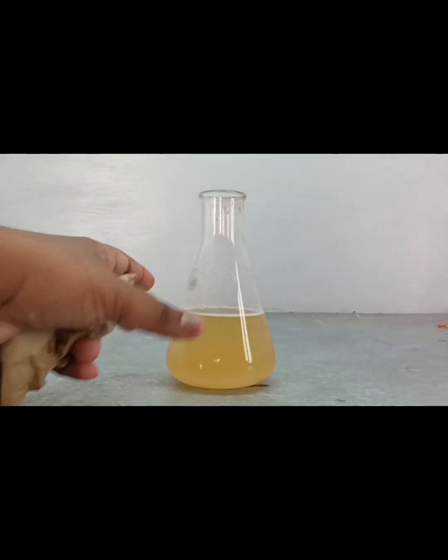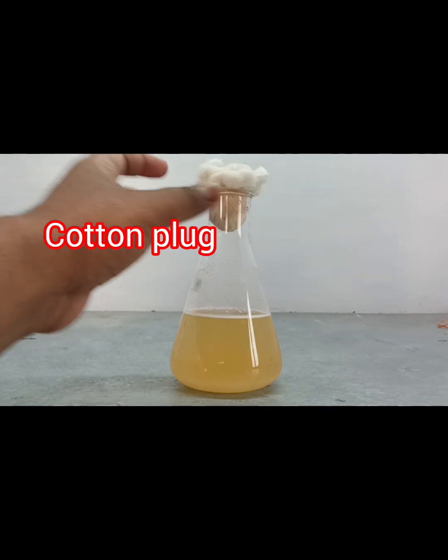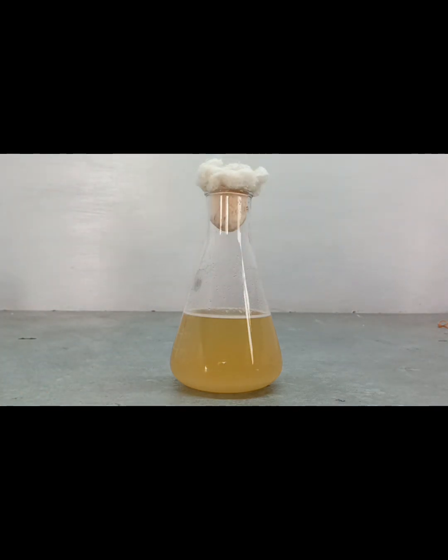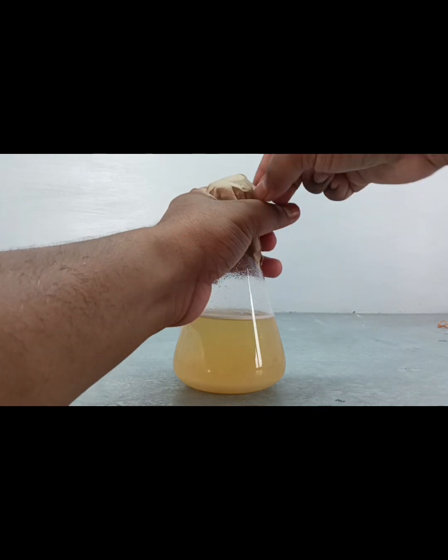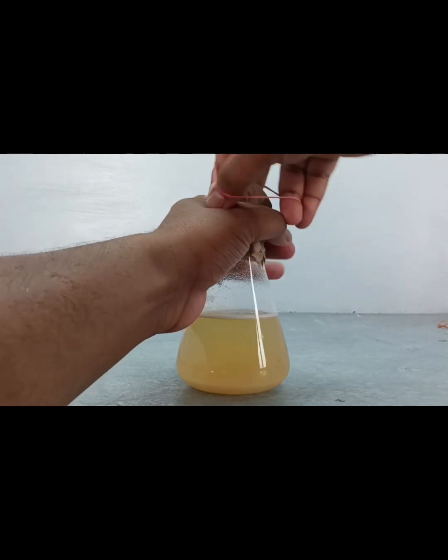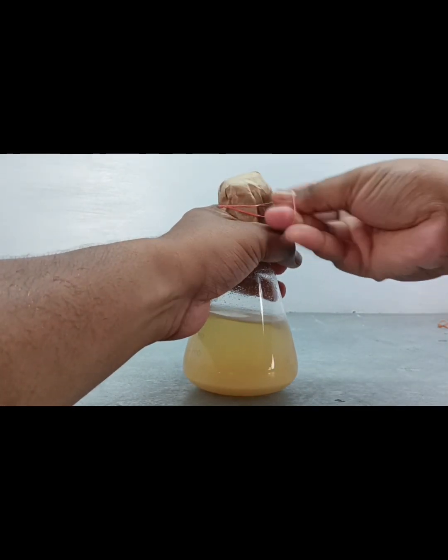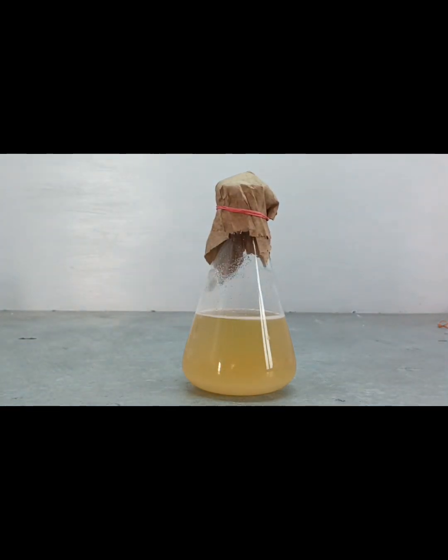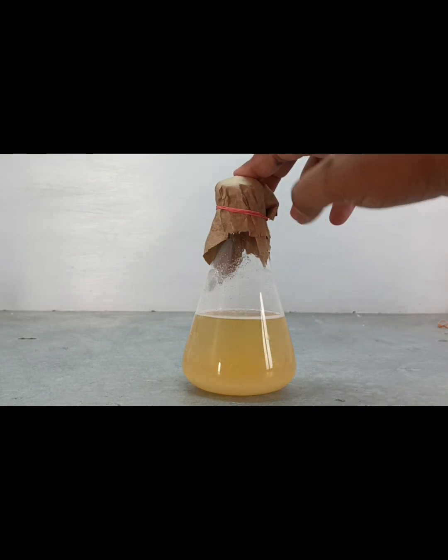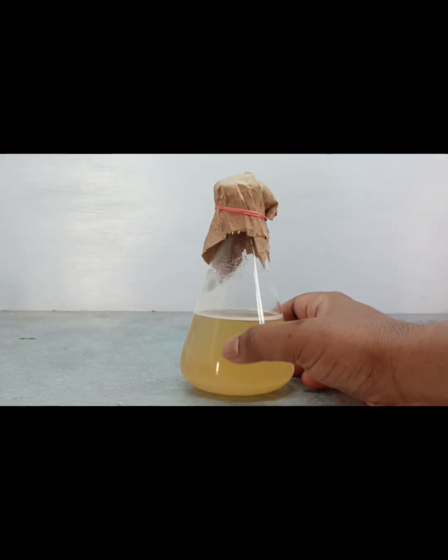After that, we plug the mouth part of the conical flask properly and then cover it with paper. The reason for this is that at the time of autoclaving, no air bubbles can enter inside the conical flask.